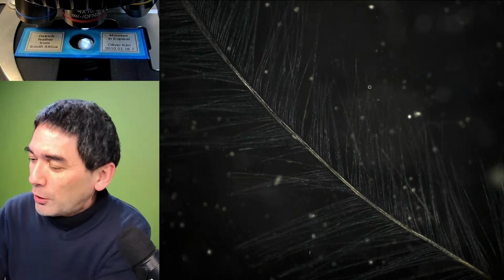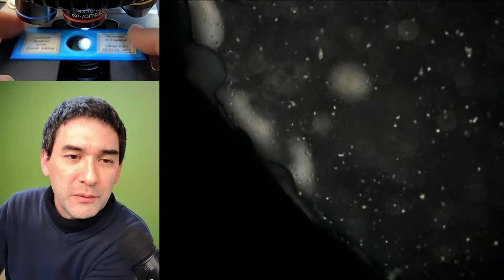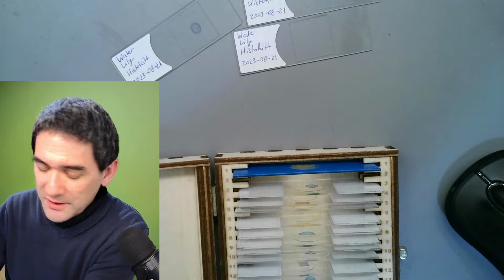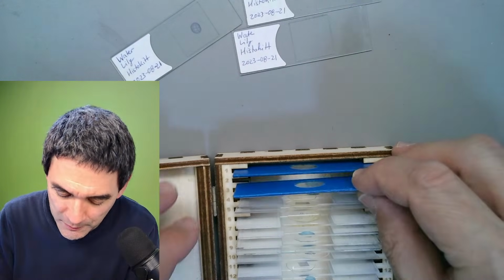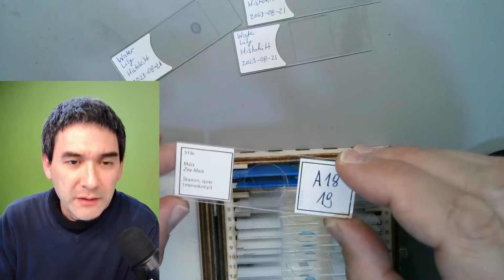So the ostrich feather is a nice one as well, also mostly sentimental value for me. And now let's move over to some of the commercially prepared slides, and they essentially are kind of expensive.